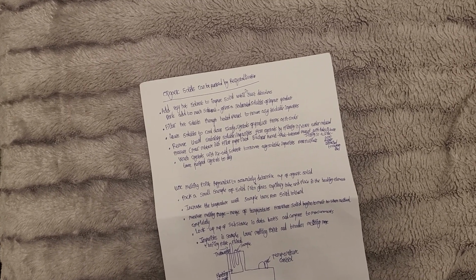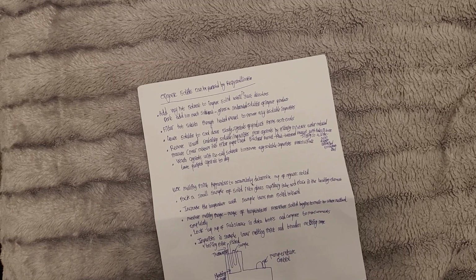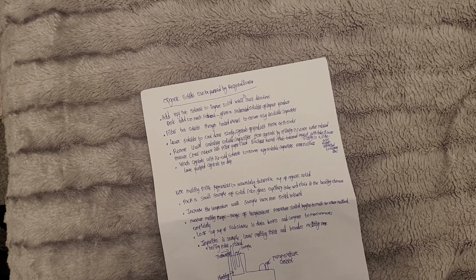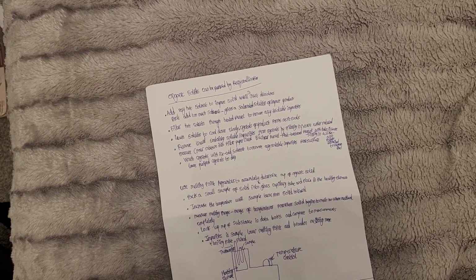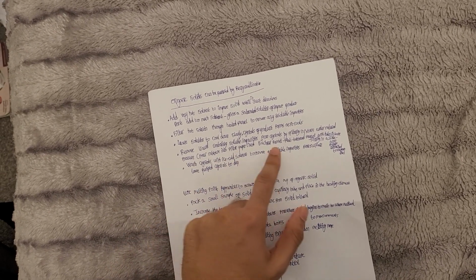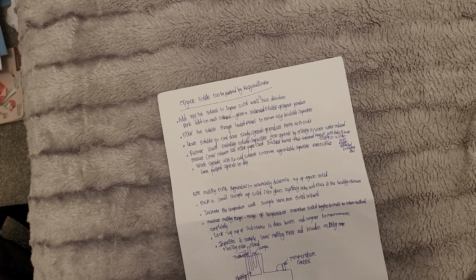Okay, what we want to do is pour the mixture into a filter paper lined Buchner funnel, a flat bottom funnel with holes in the base of it sitting in a side arm flask attached to a vacuum line. Wash the crystals with ice cold solvent to remove any soluble impurities from the surface. Leave the purified crystals to dry.